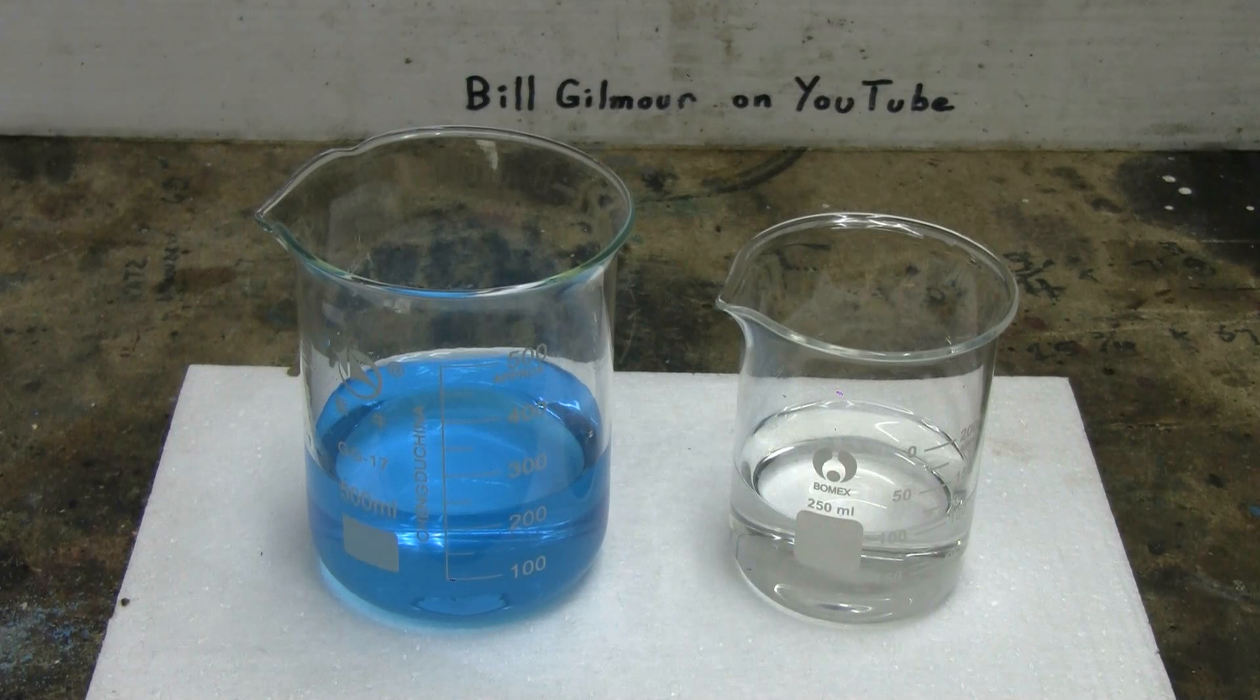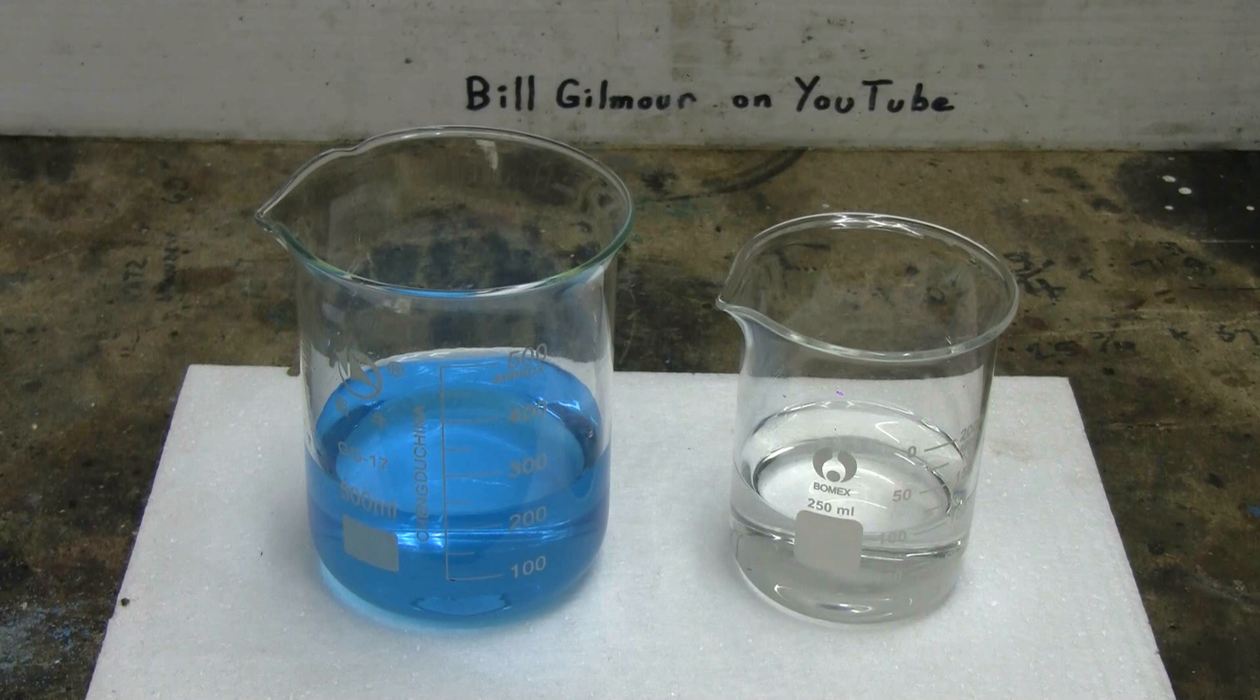To prepare Chevreul salt, in the 500 milliliter beaker on the left, I've taken 12 grams of copper sulfate and dissolved it in 200 milliliters of water. The beaker on the right is a 250 milliliter beaker. I've dissolved 10 grams of sodium metabisulfite into 100 milliliters of water.